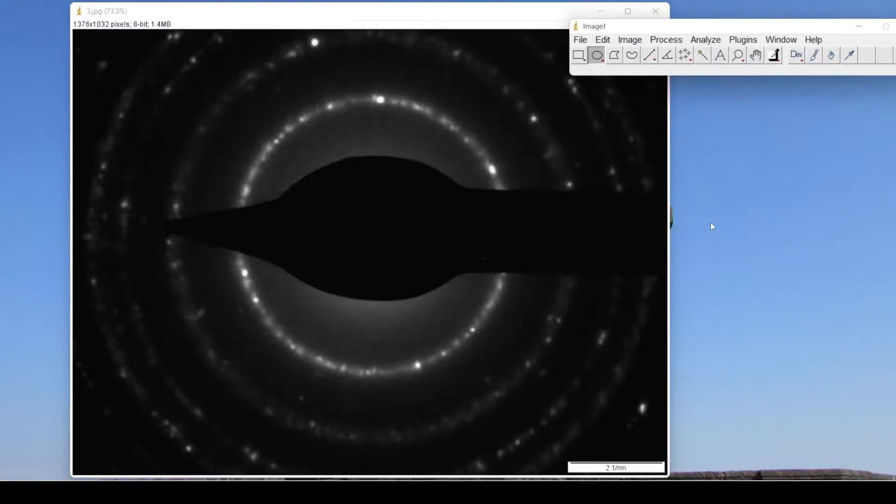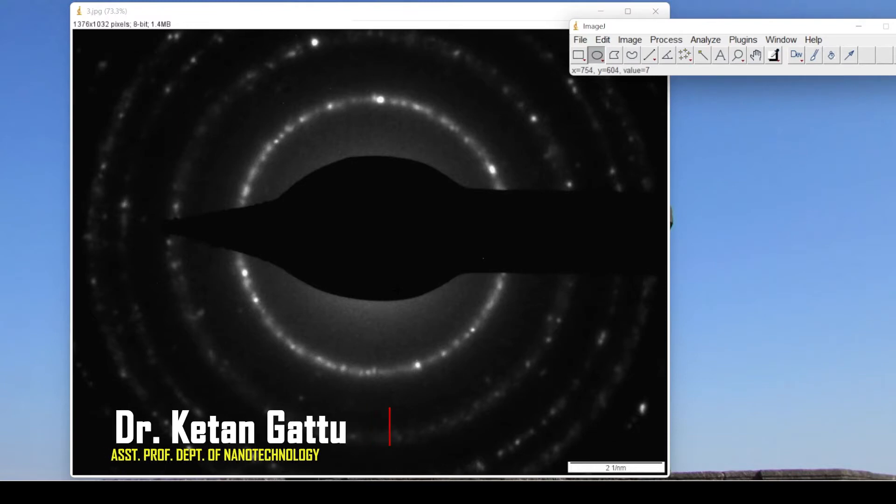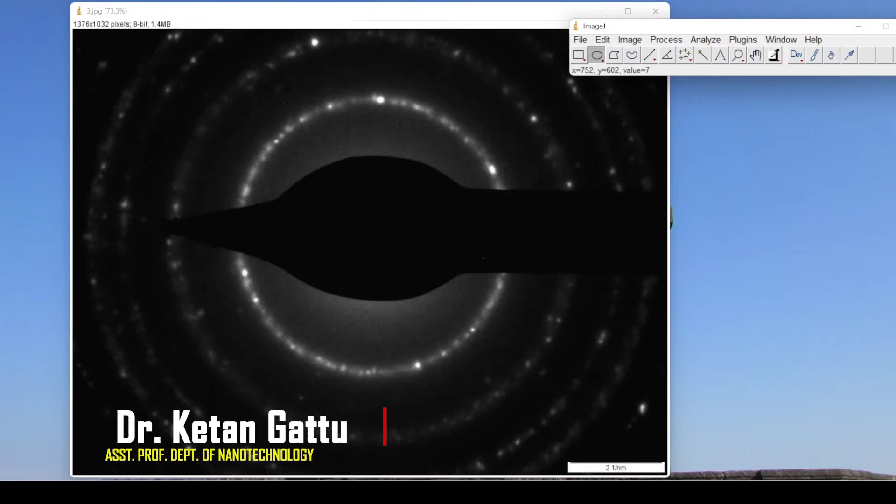Hello everyone. Today we are going to learn about indexing the SAED pattern. This SAED pattern is obtained from TEM analysis or TEM measurements.